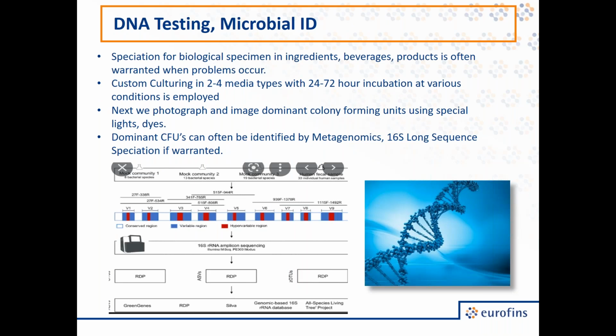Furthermore, this DNA testing can be more targeted for certain biological specimens and ingredients, beverages, finished products, and will be used in conjunction with physical, chemical, and thermographic techniques to really solve the problem.